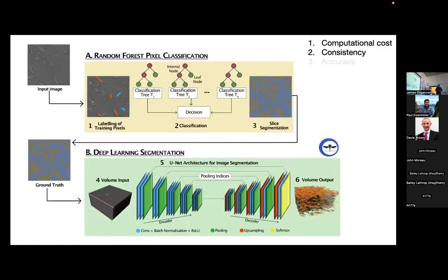Oops, sorry. Yeah. So the big step that happens with this classification input is you're moving from just a gradient field into something that has discrete domains. So you start to give information about orientation, size, geometry, this kind of thing. So the deep learning basically doesn't mind too much that the grayscale variation is different. It does a pretty good job of saying, I have more information, so I can use that information. So that extra step solves a lot of problems, because to say it the other way, without that step, all of the segmentation is bad.